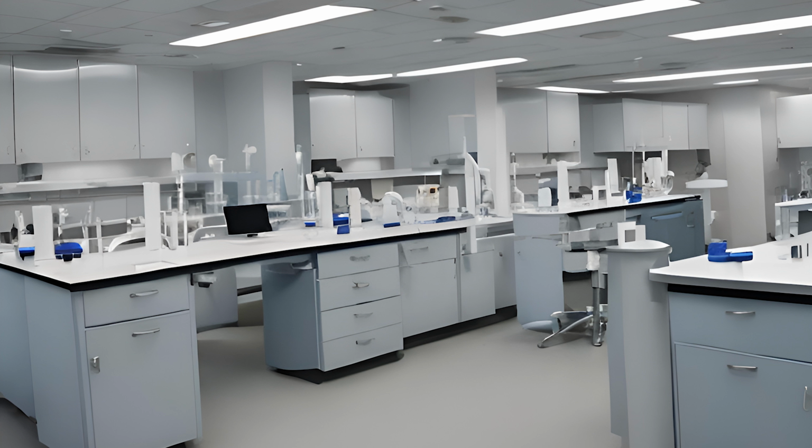Your exposure plan is going to document and be used to enforce some of the general safety rules in your lab, which are things like no eating, drinking, smoking, or chewing gum in the lab. That is an industry standard. You are not going to be doing those things in any lab that you ever work in. No mouth pipetting. That is very officially banned. That is not okay. That is not allowed.